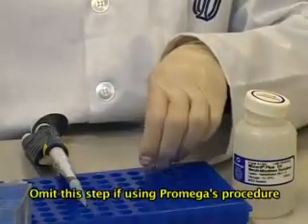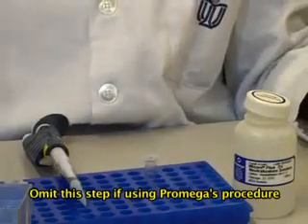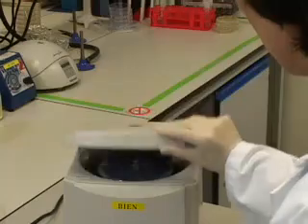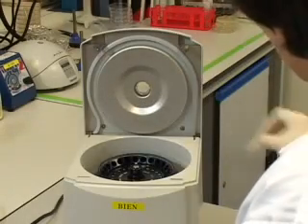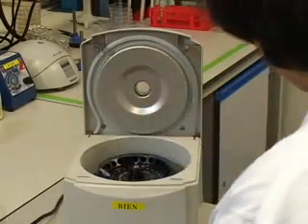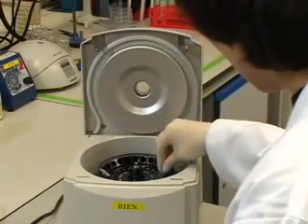Leave the tube at room temperature for 5 minutes. Then centrifuge the bacterial lysate at maximum speed in a microcentrifuge for 8 minutes at room temperature to precipitate the pellet.